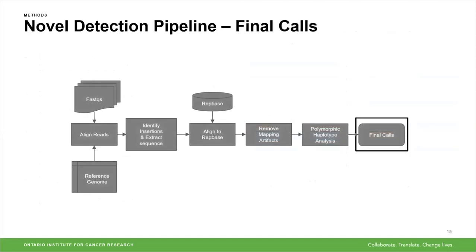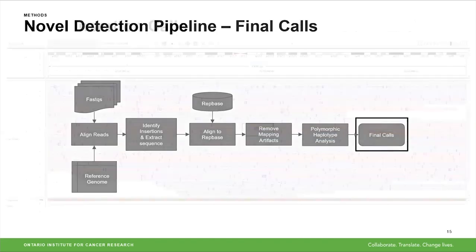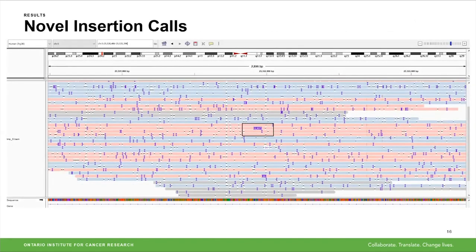This brings me to the set of final calls. Once we've completed the pipeline, we should have a set of calls representing novel insertion events. One example I'm highlighting is a just-under-3,000 base pair LINE insert in one of our treated samples at a position on chromosome 3. It's the only read with an insertion at this position — a partial LINE insertion of about 3,000 base pairs rather than the full 6,000 base pair LINE sequence, but one that we were able to detect with our pipeline that conventional SV detection methods would have missed.